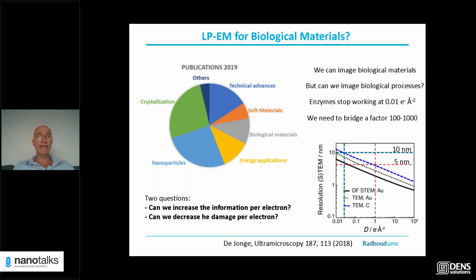It will take a while of diffusion before the new incoming solution actually reaches the viewing window, the viewing part of the chip. So the chip is much wider than its viewing window, and that means that if it is, for example, a precipitation reaction, that precipitation may already occur before the solution has reached the viewing window.